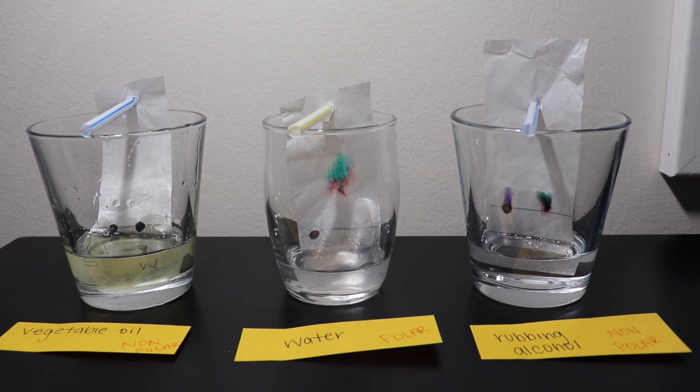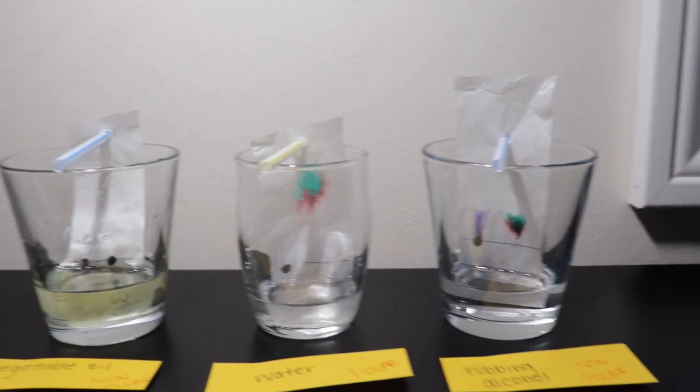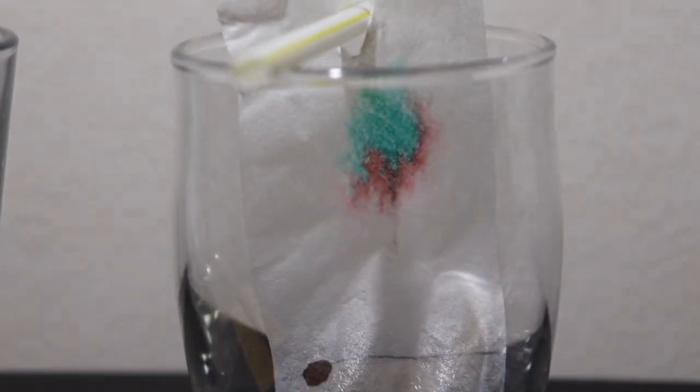For example, in the water beaker, the marker ink rises higher, proving that it is polar because water is polar. This also proves that the Sharpie ink is nonpolar because it cannot interact with the water. As each solvent rises through the filter paper, it drags up the ink that follows with its polarity because, like we've listened to before, like dissolves like, and so similar things will interact together and go up the filter paper.